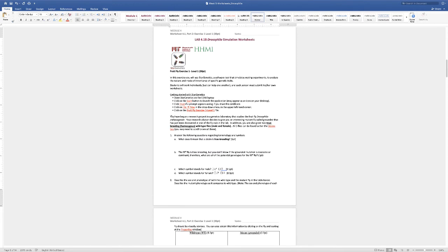So it begins here by telling you that you're going to start a research project in a genetics lab that studies fruit flies. Your advisor decides to give you an interesting mutant called grounded that has just been discovered. In addition, you are also given 2 true breeding homozygous wild-type male and female flies. All 3 flies can be found within the strains box.